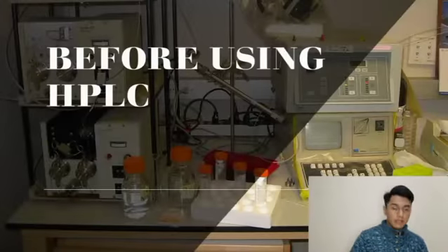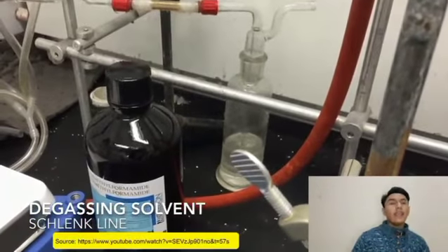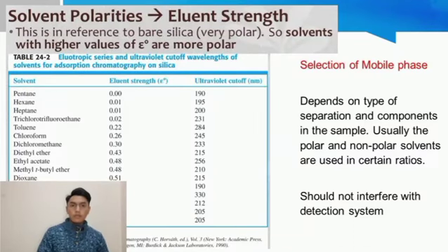Before using HPLC, the solvent should be degassed because it can cause bubbling, and the bubbles can damage the stationary phase. The selection of mobile phase must also depend on the separation components in the sample. Usually, polar and non-polar solvents are used in a certain ratio.